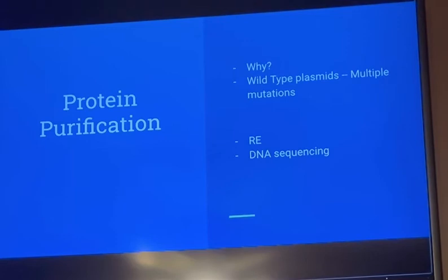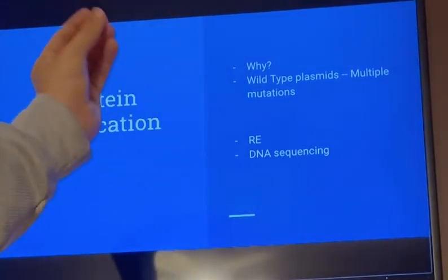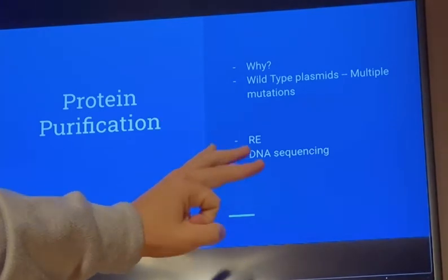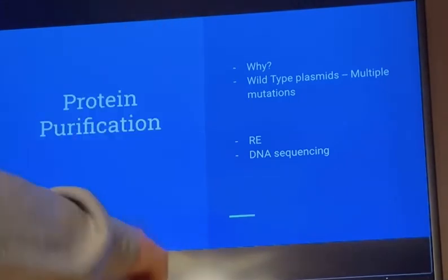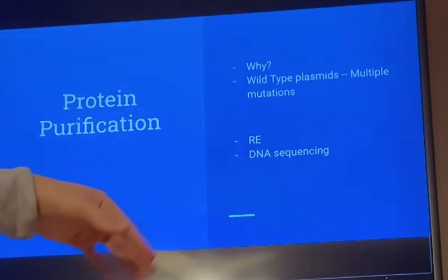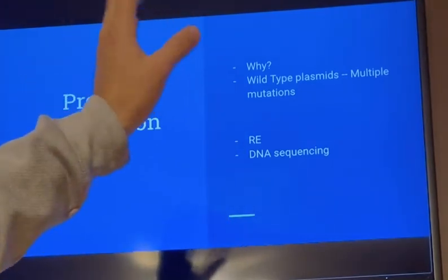Another way we could do this is centrifugation, which is when you put it in a tube and you spin it really fast, and then a pellet of cells will accumulate on one side, and then you're going to add buffers. When you add buffers to it, it's going to break down all the material that you don't want, because we just want to focus on the plasmid. It's going to subtract all the things you don't want, cell walls, all that. All we want is the plasmid.